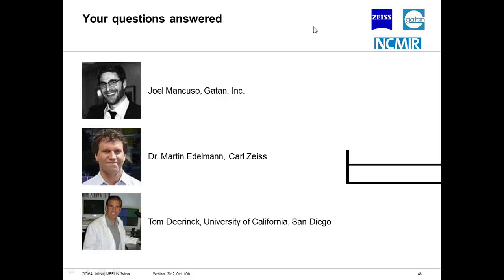And I believe that we're going to start seeing serial blockface specimen preparation, like new ideas. And I think the 2 places, again, is the staining, and that's one area. But the next is the resin, and creating resins that are more beam tolerant.